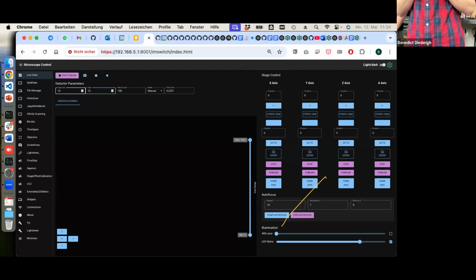This is a straw? No, not quite. It's a special material, but good that you ask. It's a tube where the sample is inside, and the refractive index of the material is the same as water. That means in water it becomes fully transparent, so the light is not scattering at all. What is that material? It's Teflon. FEP stands for fluorinated ethylene propylene.